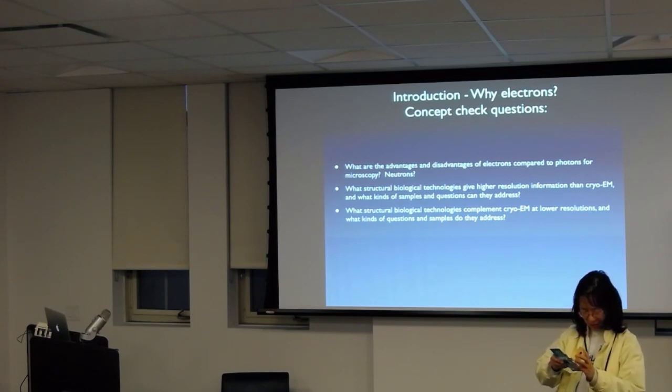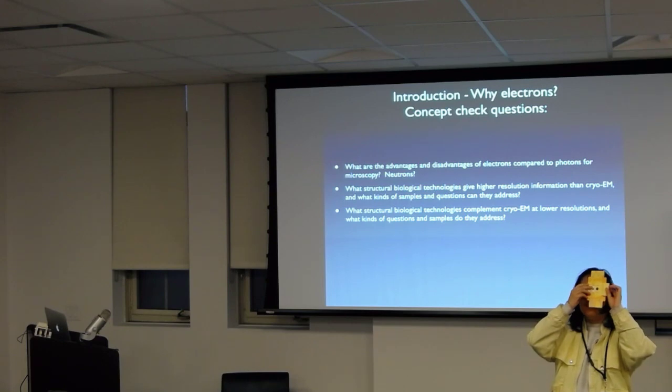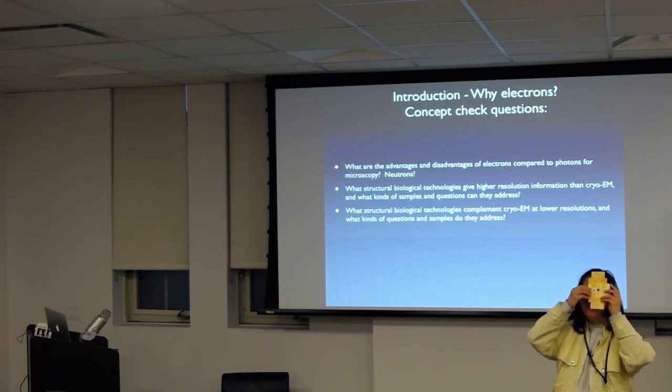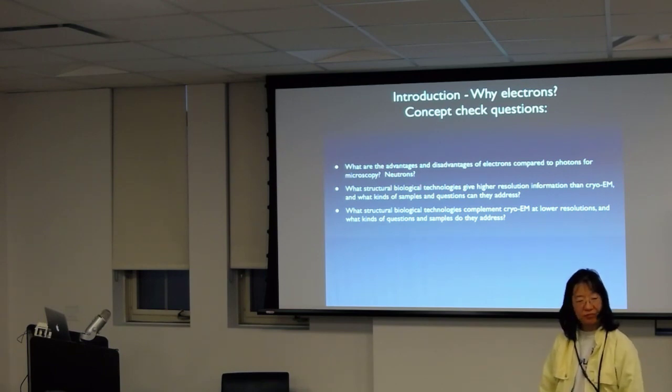Youngzi and I are going to be running a couple of journal clubs and practical sessions. So one of the first practicals is going to be aligning a microscope. We're going to start with FEG alignments, probably on the F20. So we'll do an alignment of the FEG and then we'll align the condenser system. That's usually about what we can get through in the amount of time that we'll have.